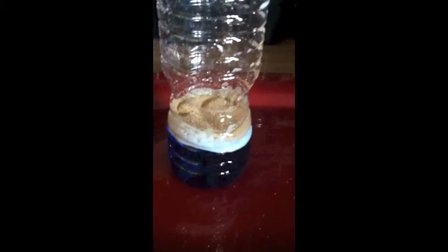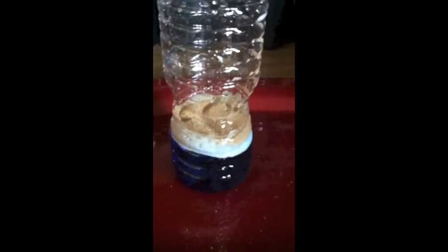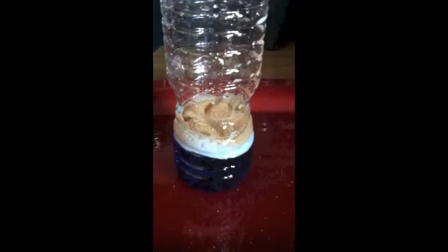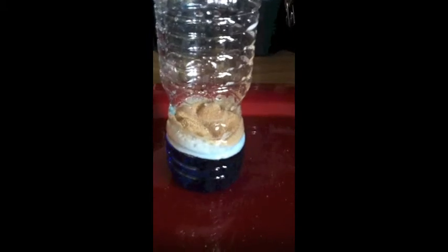So it's creating a little bit of initial foam and a little bit of an initial gas reaction when added to the hydrogen peroxide and dish soap, but it's not fully rising very quickly or very much at all. It has risen a little bit, but not a lot.